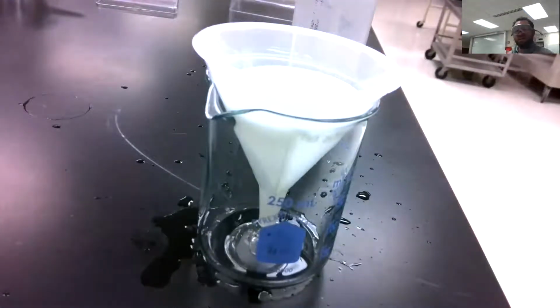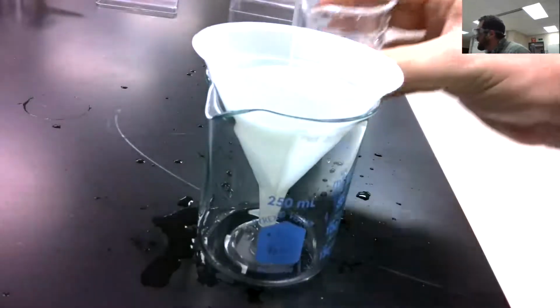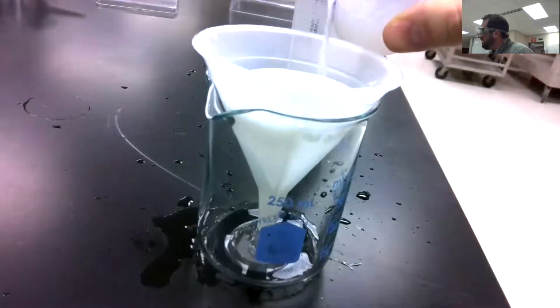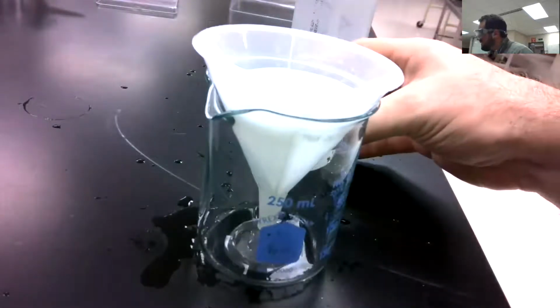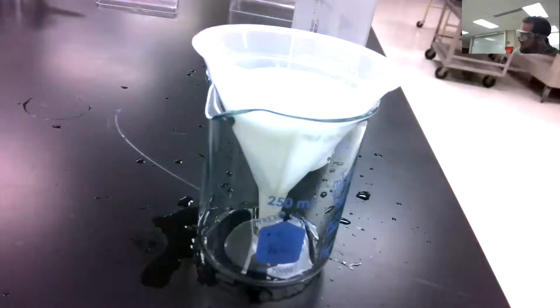It's quite a slow process here, but as we wait for this to occur, I'm going to get you guys started on some of your data collection on the backside of the lab. Very slowly, just letting that drip.